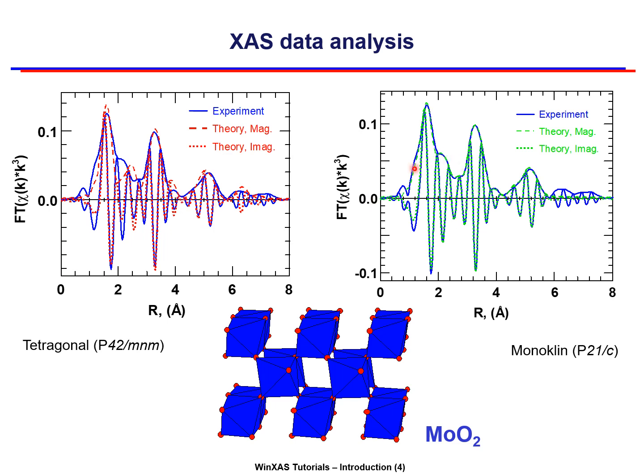Given a good agreement between theoretical and experimental XAFS function, structural parameters such as nearest neighbor distances, coordination numbers of various coordination shells around the absorbing atoms, and disorder parameters can be obtained.